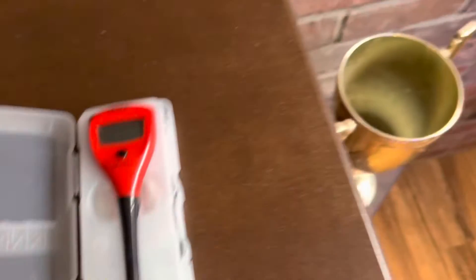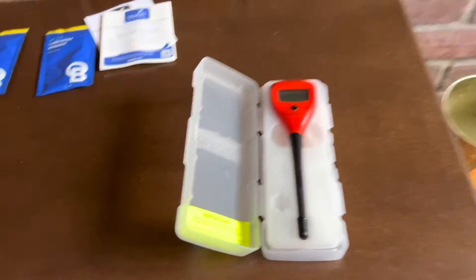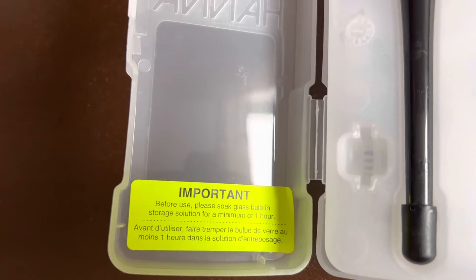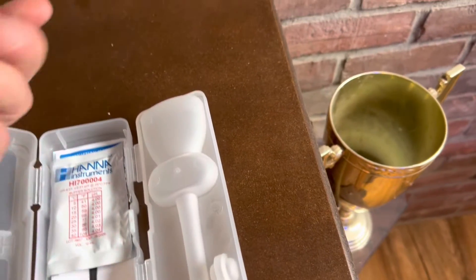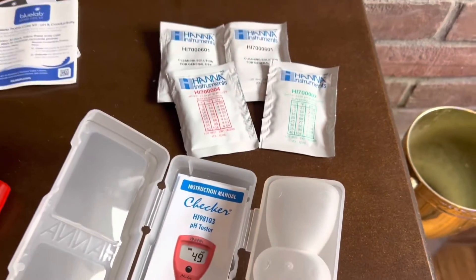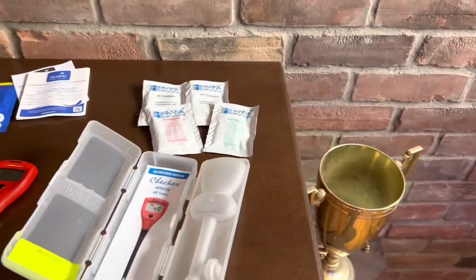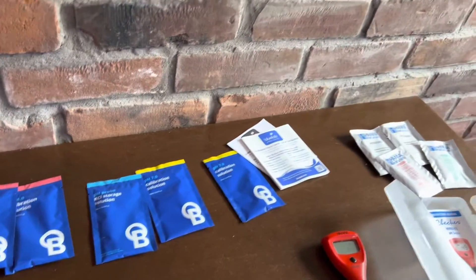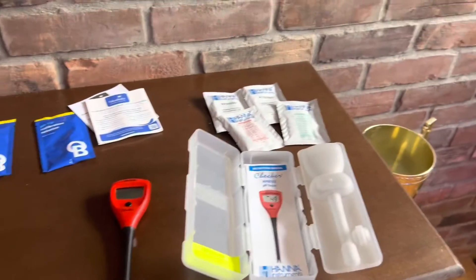Here's what I recommend. First of all, the Hannah — when you first get it, there's a lot of things on the internet that are not very clear about buying this thing. I did a lot of research. Before you use it, soak the glass bulb in storage solution for an hour. Well, this bad boy comes with pH cleaning solution and pH 4 and pH 7 calibration solution times two. But storage solution doesn't come with it. So what I recommend after doing some research: go on Amazon — I'm in Canada — and get the Blue Lab probe care kit. It's about $37 Canadian. The Hannah is $55, so you're looking at about $100 with tax for the whole kit and caboodle.